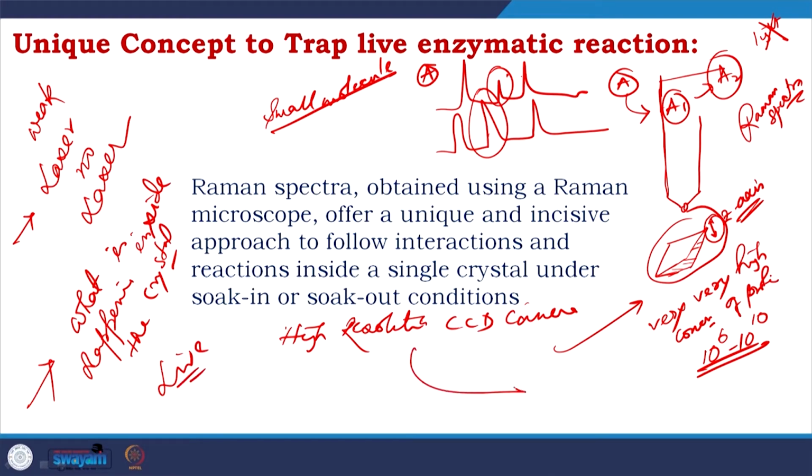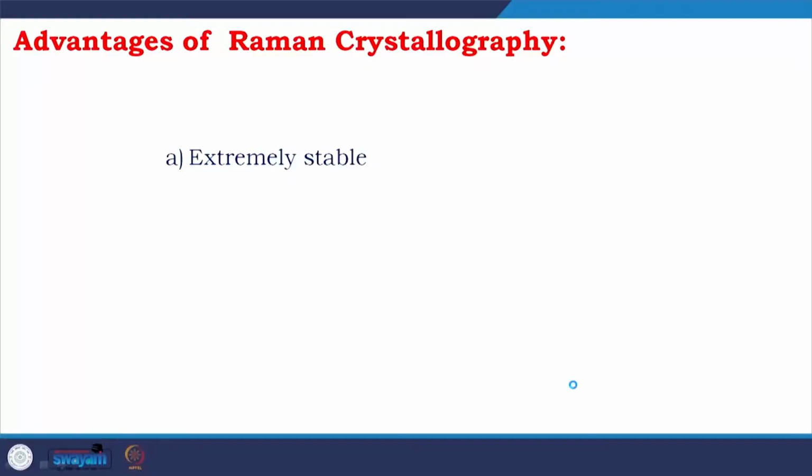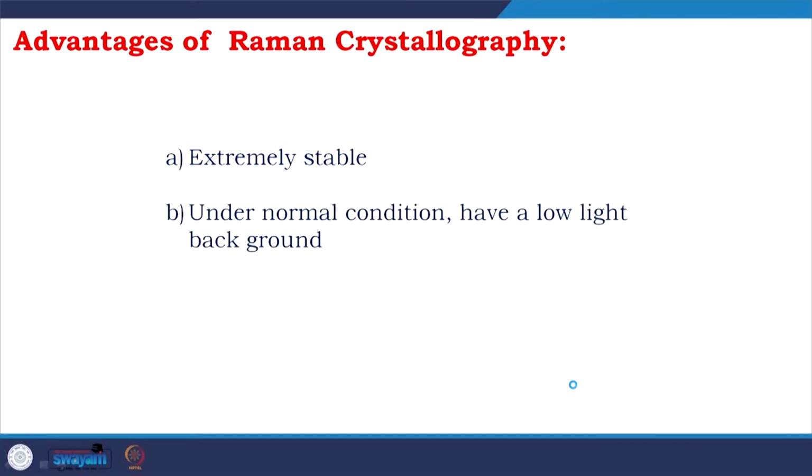The data you are getting here, you have the baseline of the intact compound, and whatever is coming through, you are aligning it. So, whenever you get a change, you know that this is the time when the bond is breaking or making.